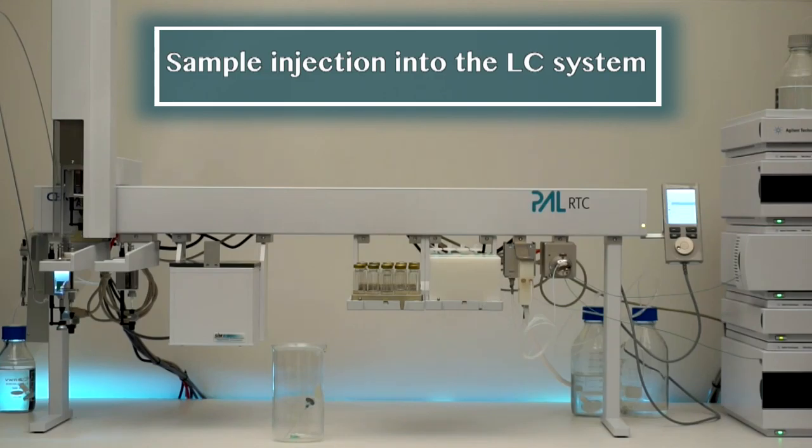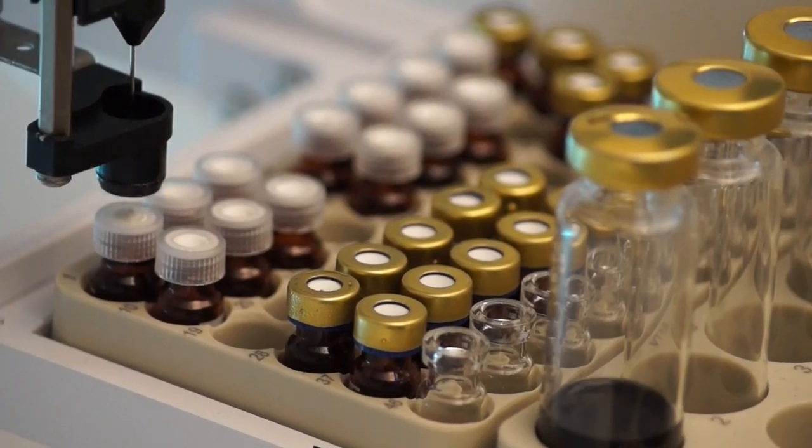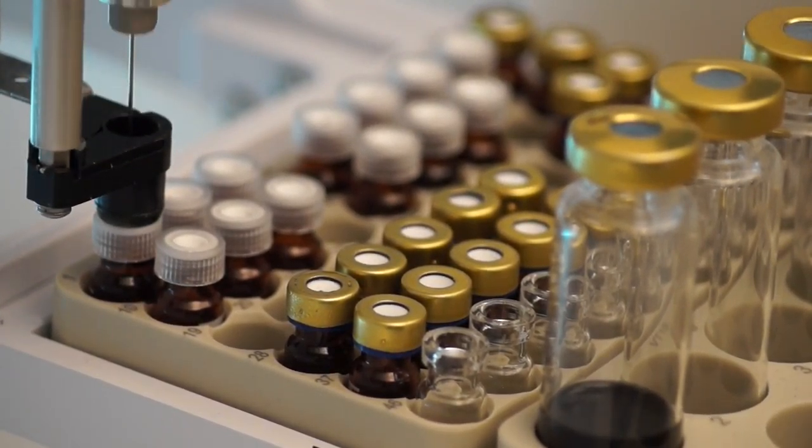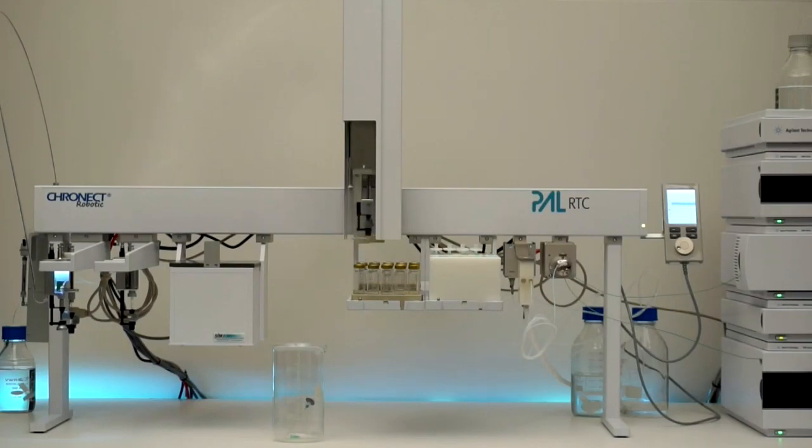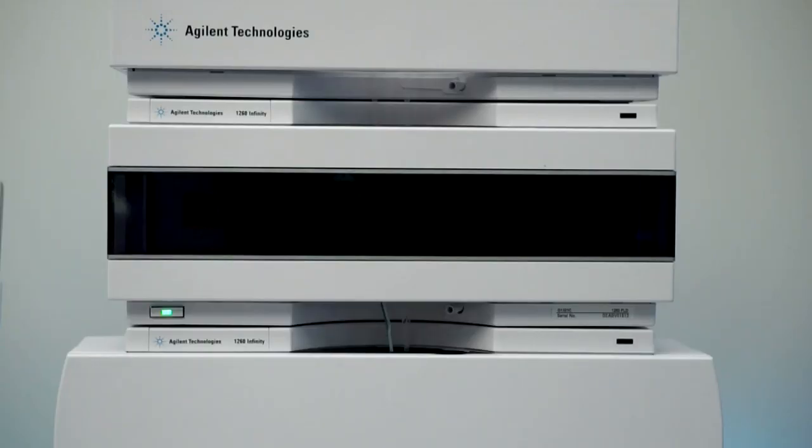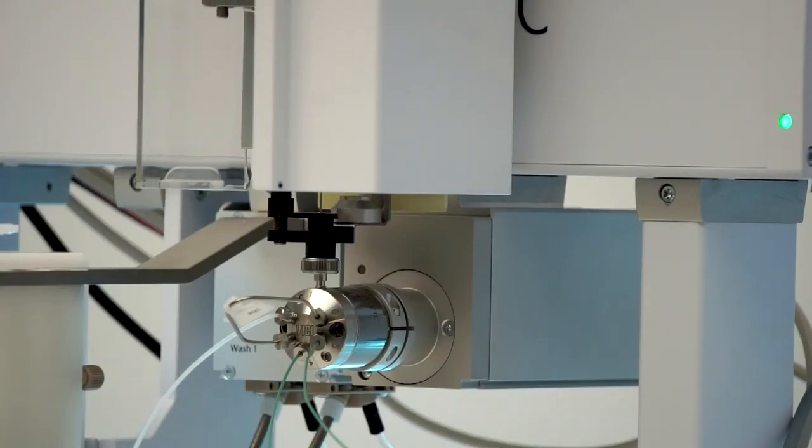Sample injection into the LC system. For injection, the 100 µL syringe is pre-purged with the sample and the sample valve is filled. The robot then waits for the ready signal of the LC and injects the sample into the LC system.